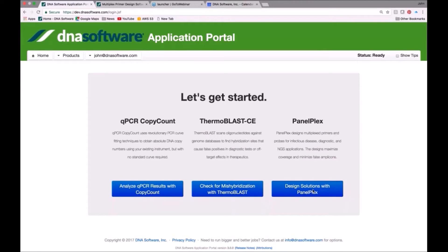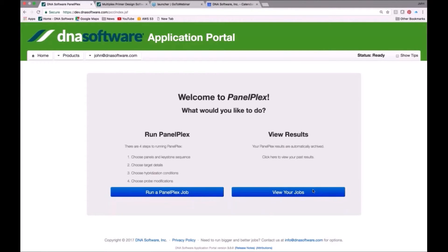Let's go ahead and design some solutions with PanelPlex by clicking on the blue button. And let's go ahead and now run PanelPlex.